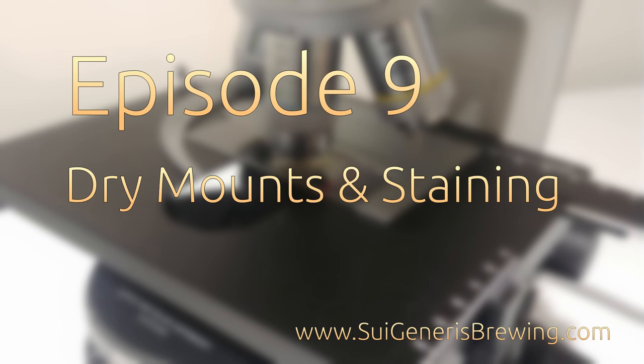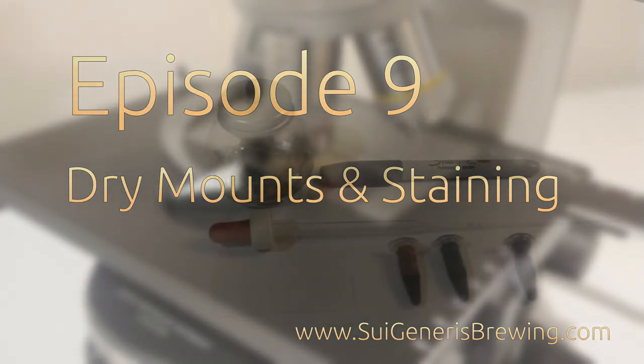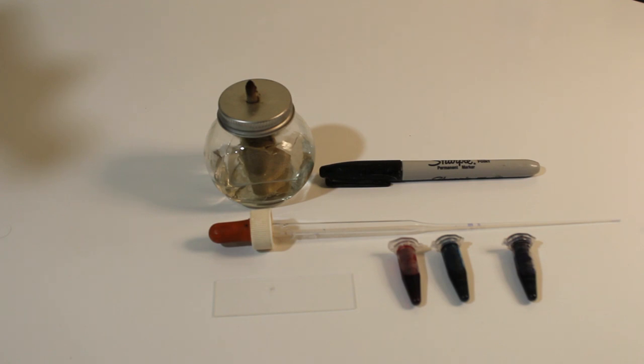Welcome to Episode 9 of Microbrews, my new video series on how to make the best use of a microscope in your home or craft brewery. In this episode I'll be showing you how to prepare a dry mount and then use chemical dyes to stain your sample in order to better view yeast and bacteria in your brewery samples.